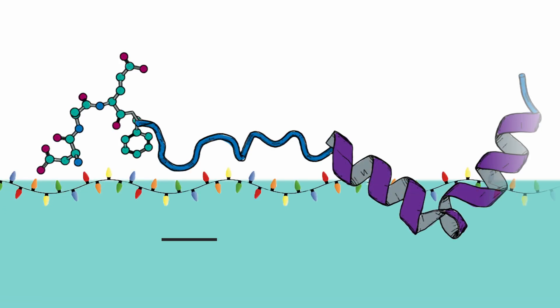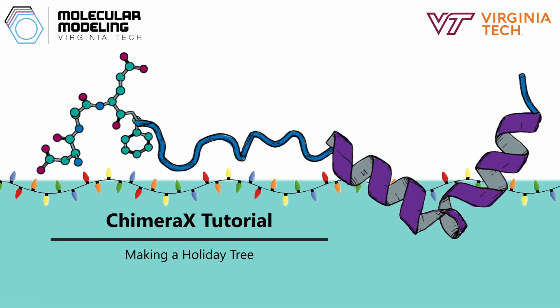This video is brought to you by the Brown Lab at Virginia Tech. Hey everyone, in this video we wanted to do something a little bit different for the holiday season. We're going to use Chimera X to make a holiday tree with flashing lights.